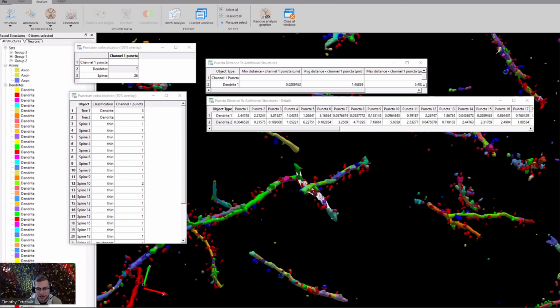We're running close to the time limit. We're a little bit over actually, but I appreciate everybody asking all these questions. This is amazing. I'm just going to hopefully go for this last one here from Claudia before I end things here. But the question is about puncta detection using the center of mass. I'm asking to know if it could be detected something like a ring.